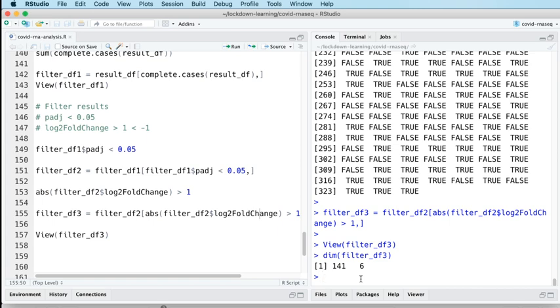And we want to learn more about those genes. So we want to learn more about what they are and what they do, both individually and in coordination. And so that's what we're going to do, not today, but probably we'll begin that process tomorrow, to have a think about what those genes are. So we need to identify them. So we need some annotation for those genes, but also think about what they do.